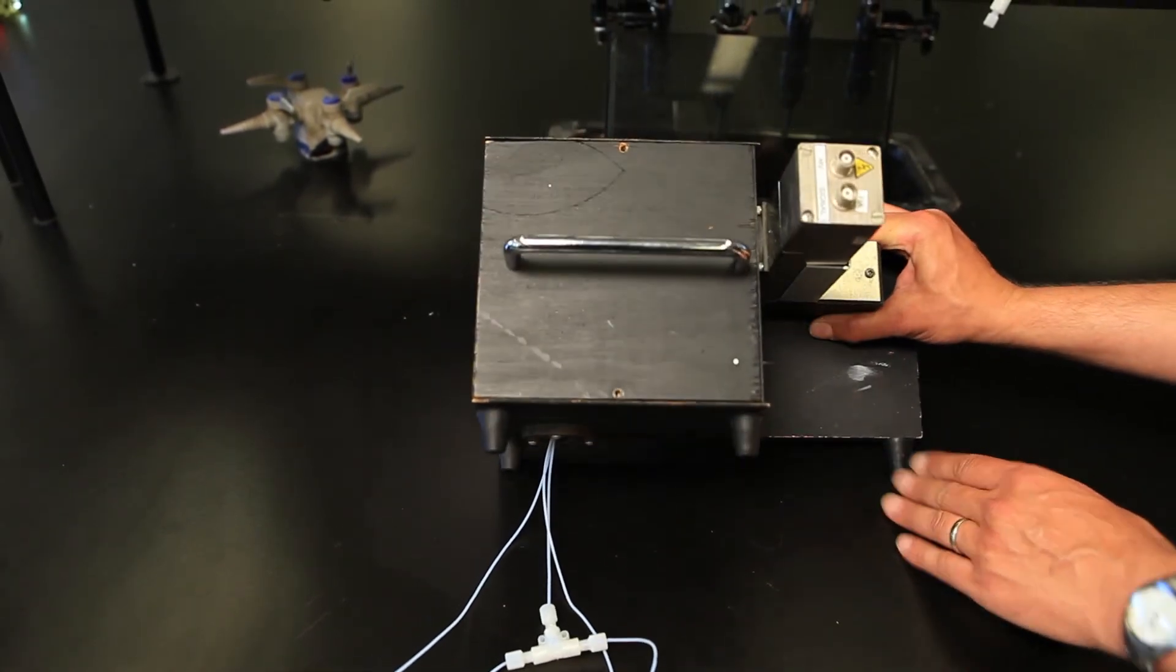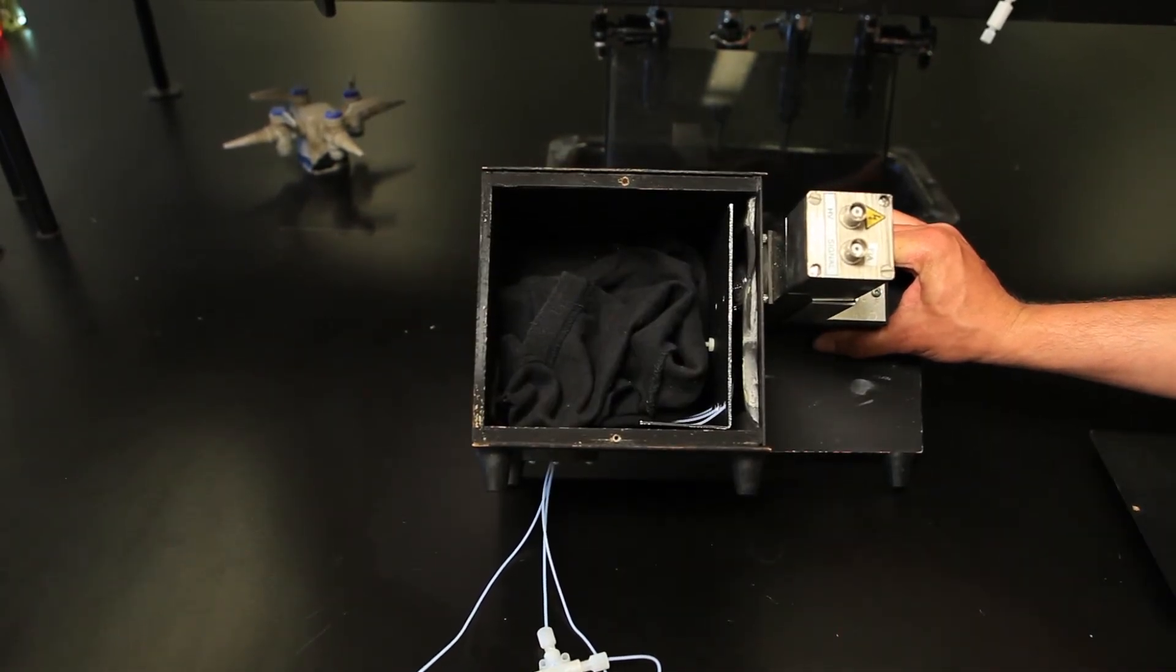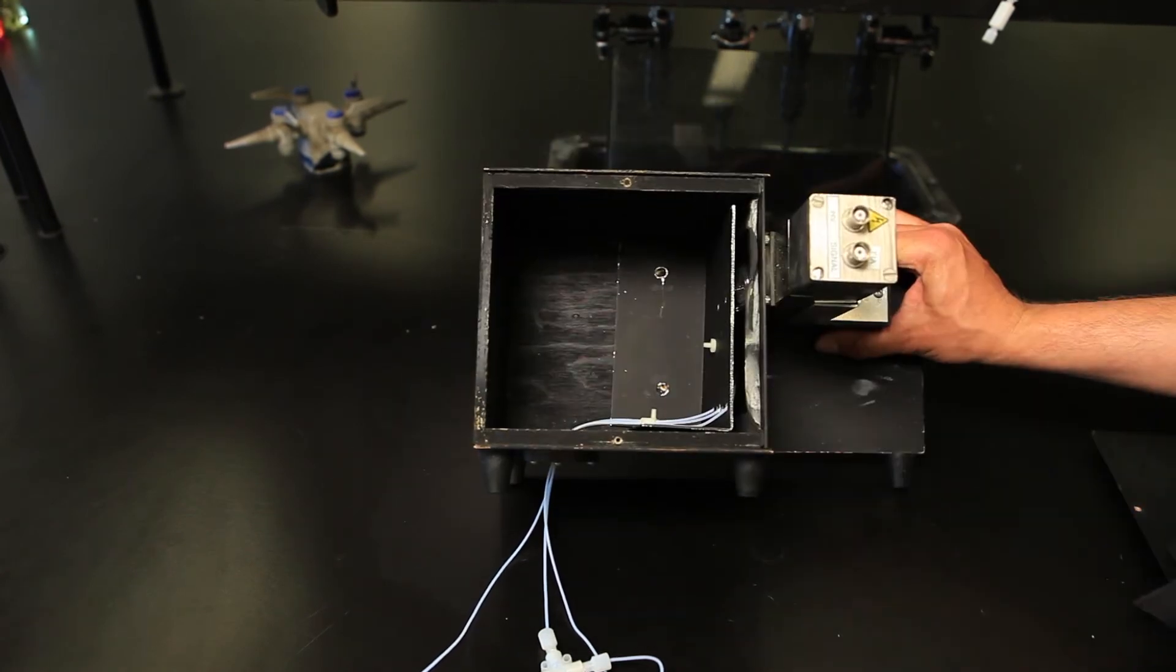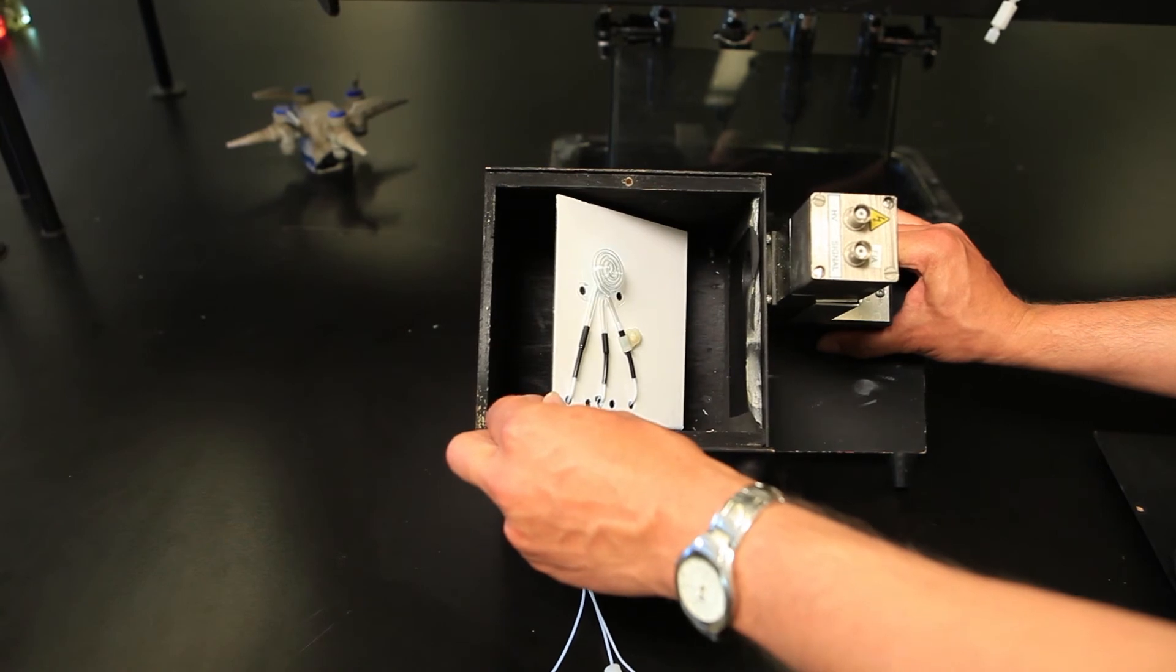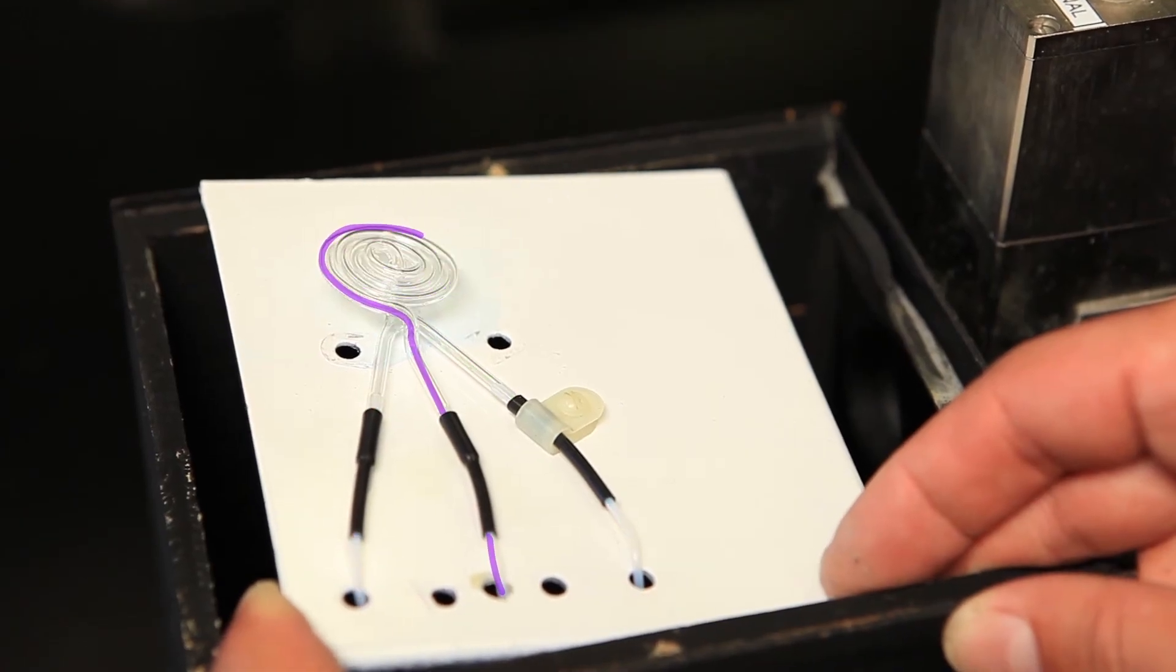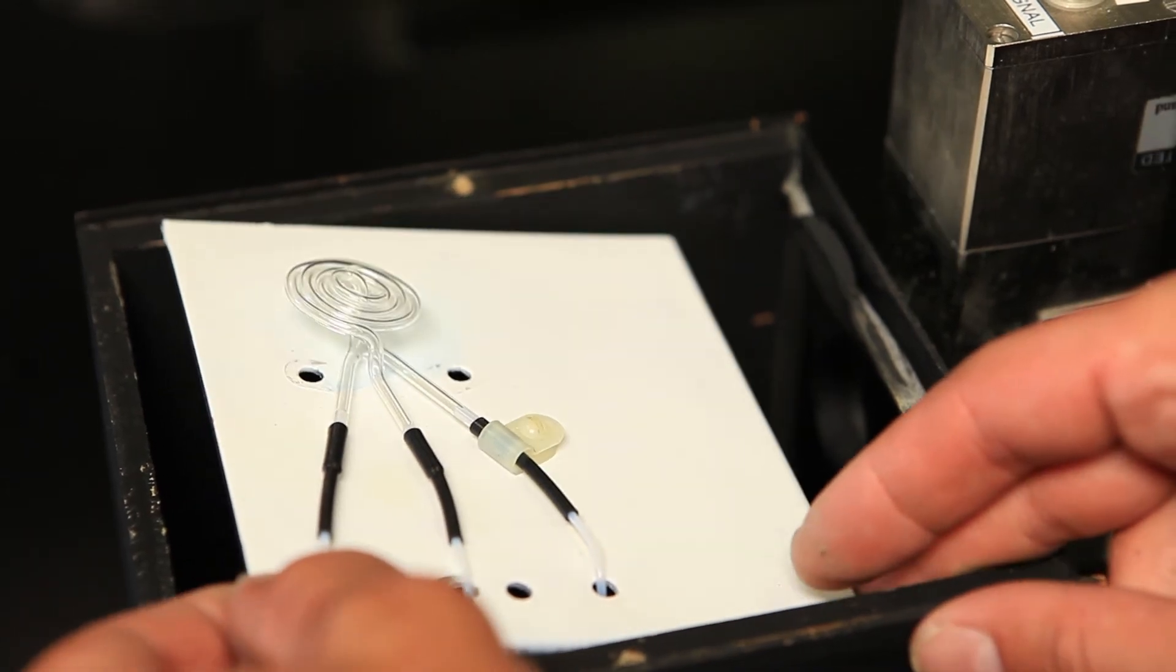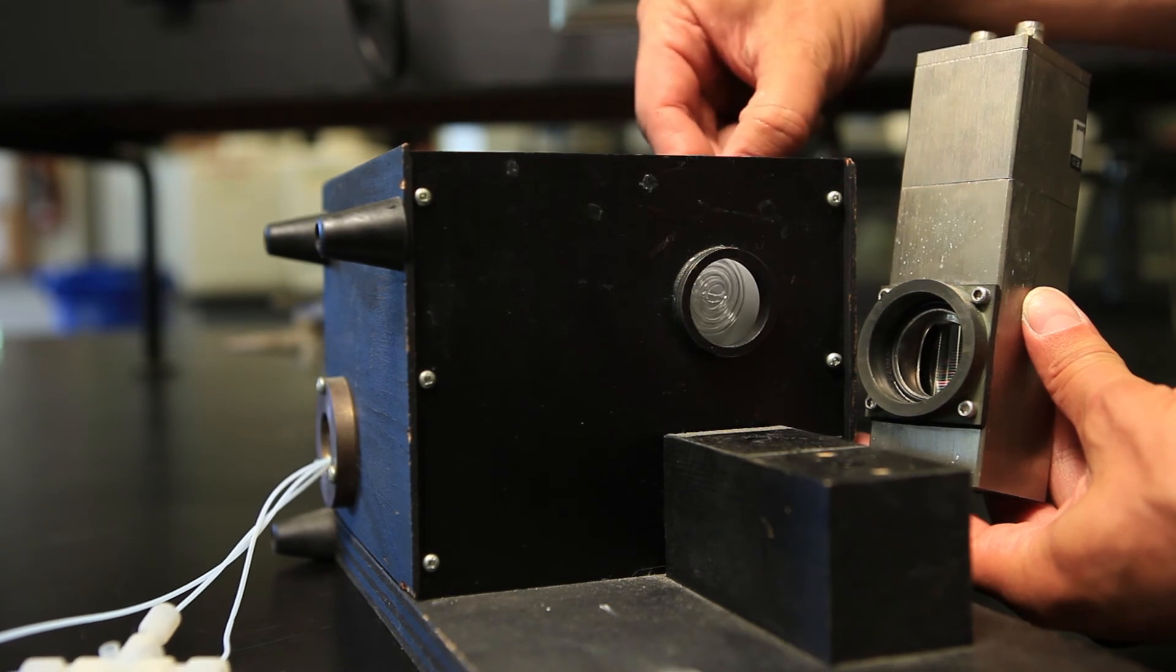The inside of this box is basically empty. It contains a black cloth to block any stray light that enters through the hole at the bottom, and a metal plate that has a spiral-shaped glass coil on it. This spiral coil acts as the cell compartment. The top and bottom tubes carry their reagents into the coil, while the middle tube carries the waste out of the coil. The reagents mix in the coil, and the chemiluminescence reaction occurs.